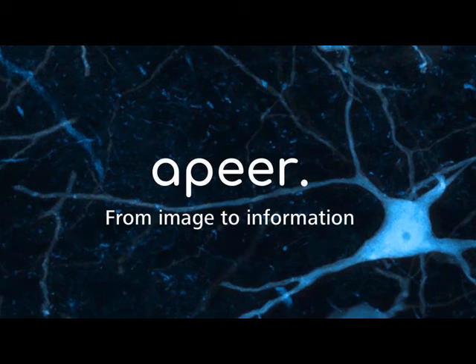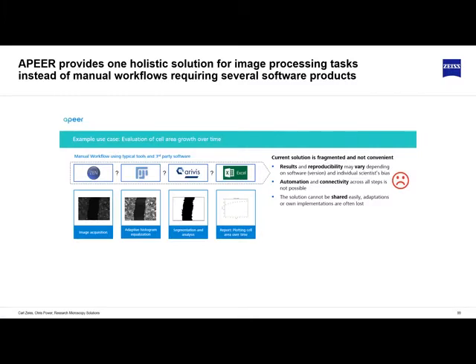APEER is a platform designed not just for Zeiss users, but for any users. It's a web-based platform where you can develop image processing. Now, why might you want to do that? In the example I just gave you with the scratch wound, you take your images in ZEN, you might do some form of image improvement, contrast enhancement using anything. It could be Python, Fiji, whatever your choice is. You might do segmentation, that could be with IntelliSys, it could be with something else. And then you might plot your data in Excel.